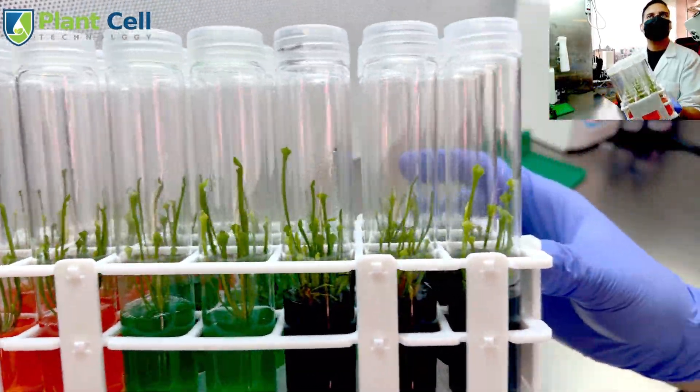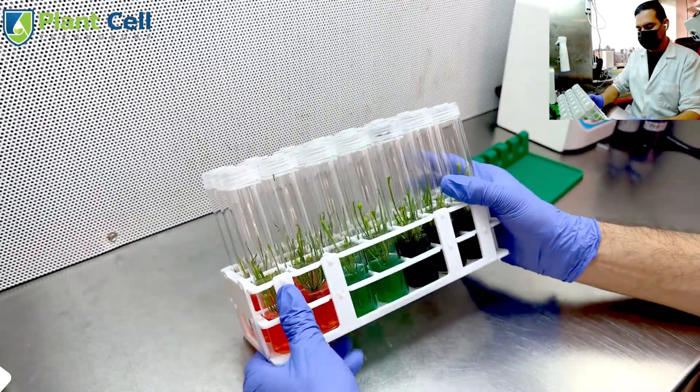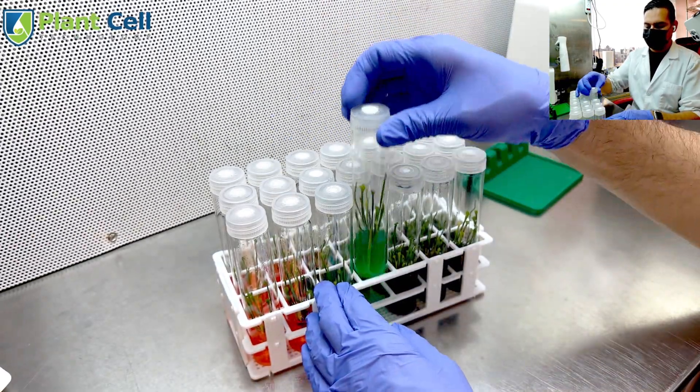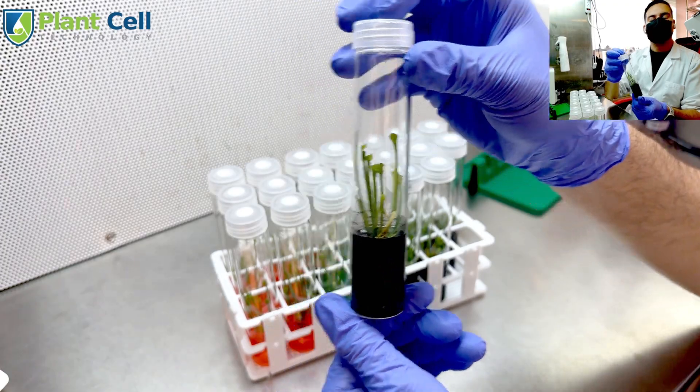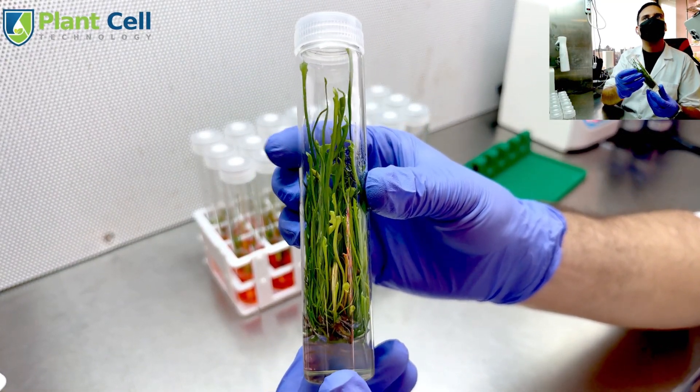And that's it. In less than two hours, I was able to make 21 beautiful Christmas gifts for everybody in my family. These are great — it only cost me around $2 to make each, and they do last for a very long time. Like this one in this other test tube — it's been growing for 10 months.